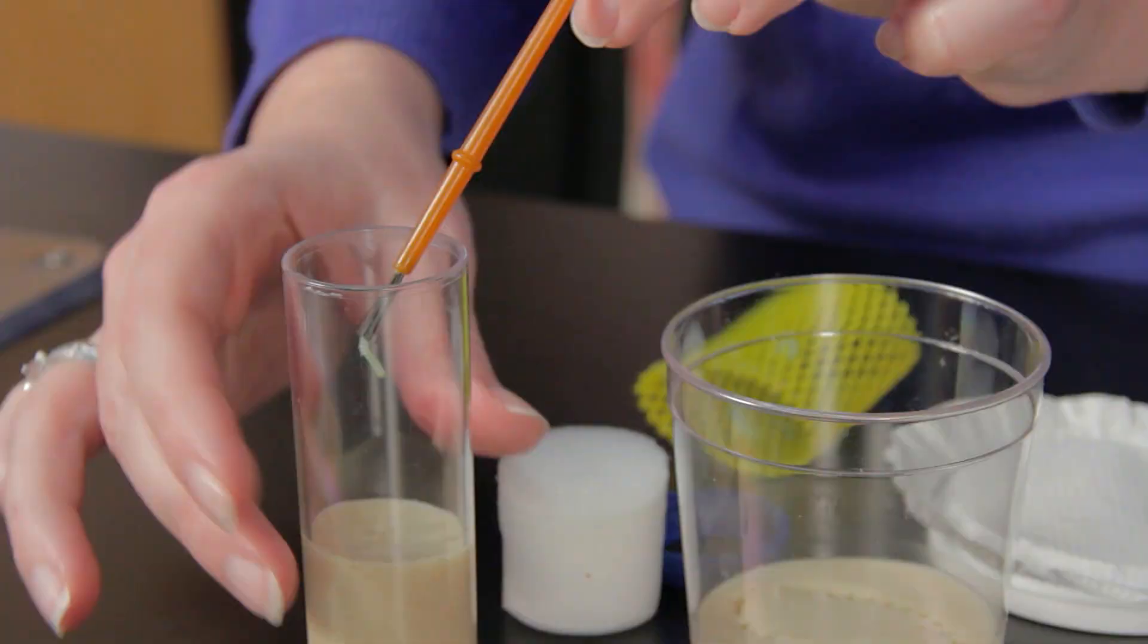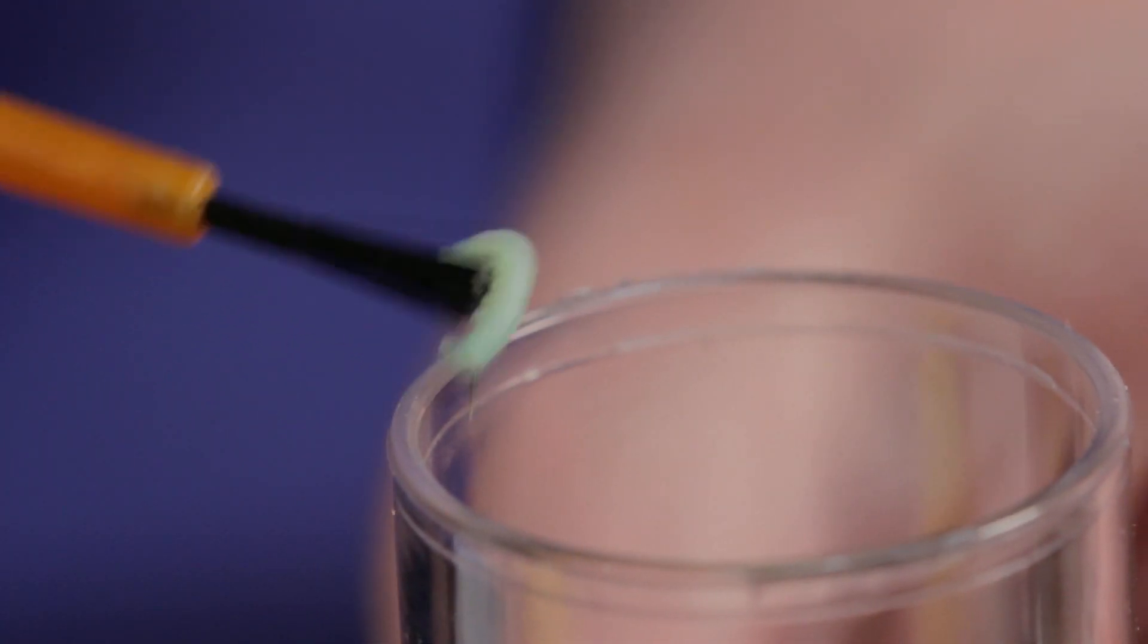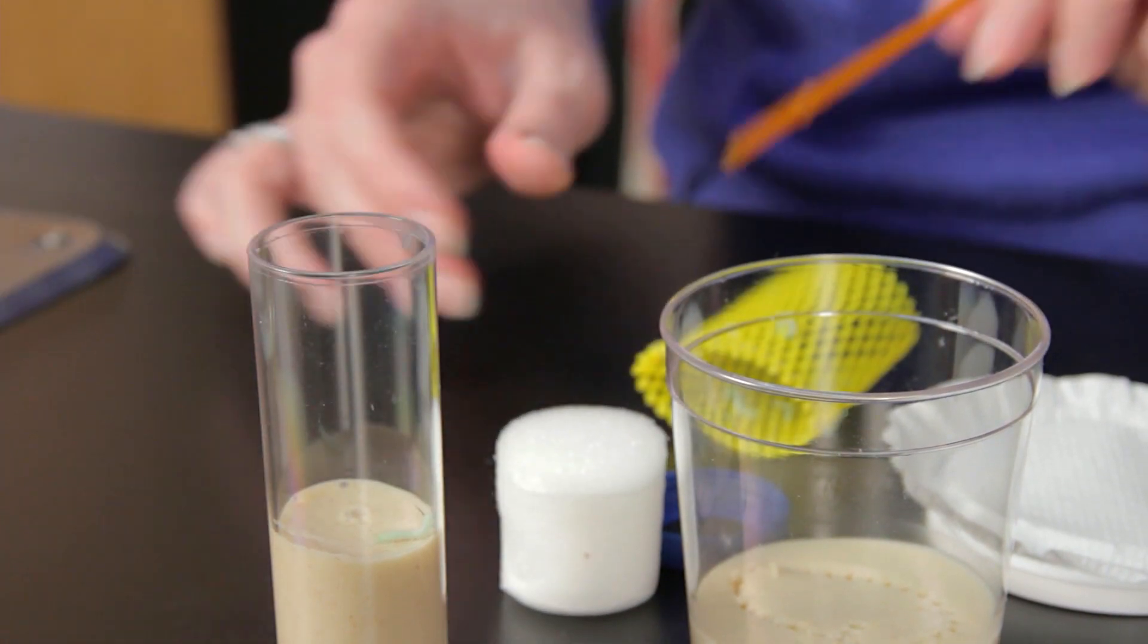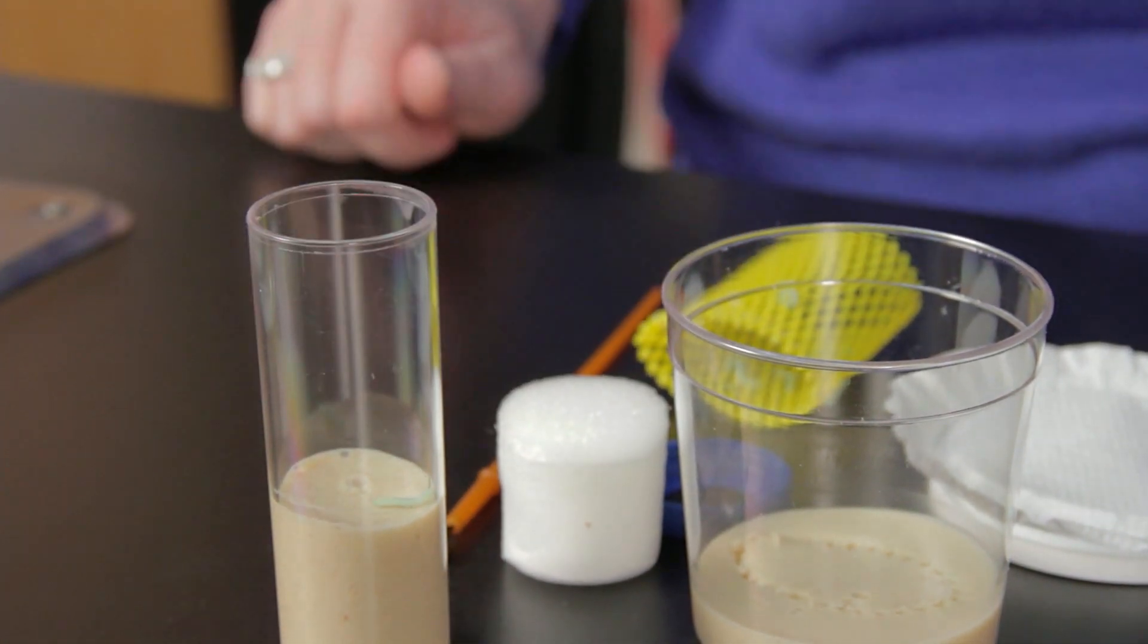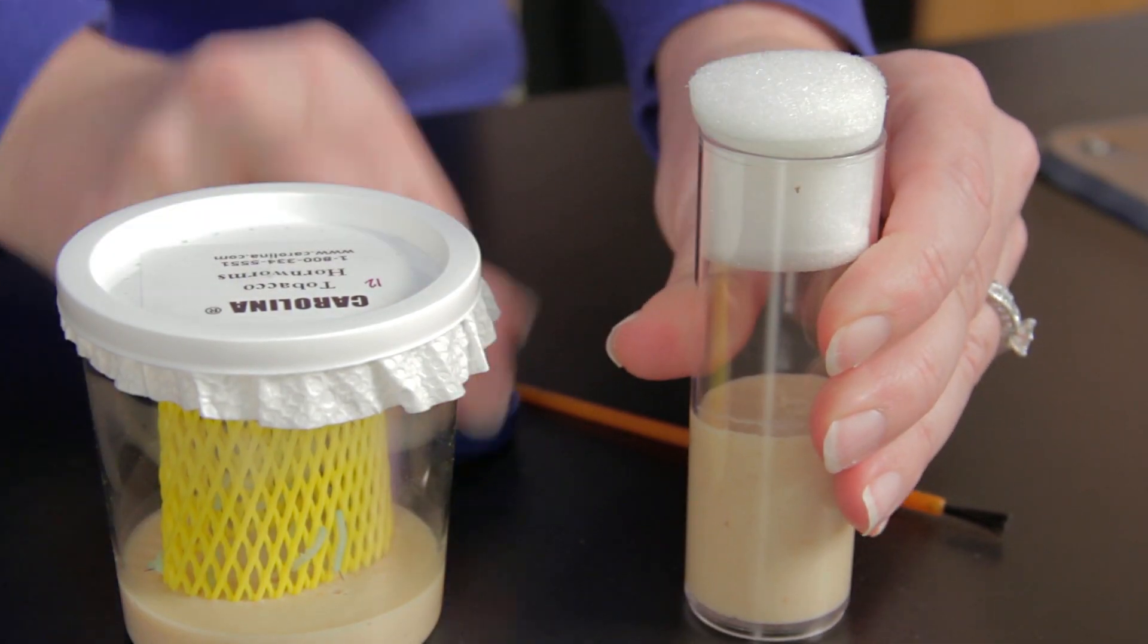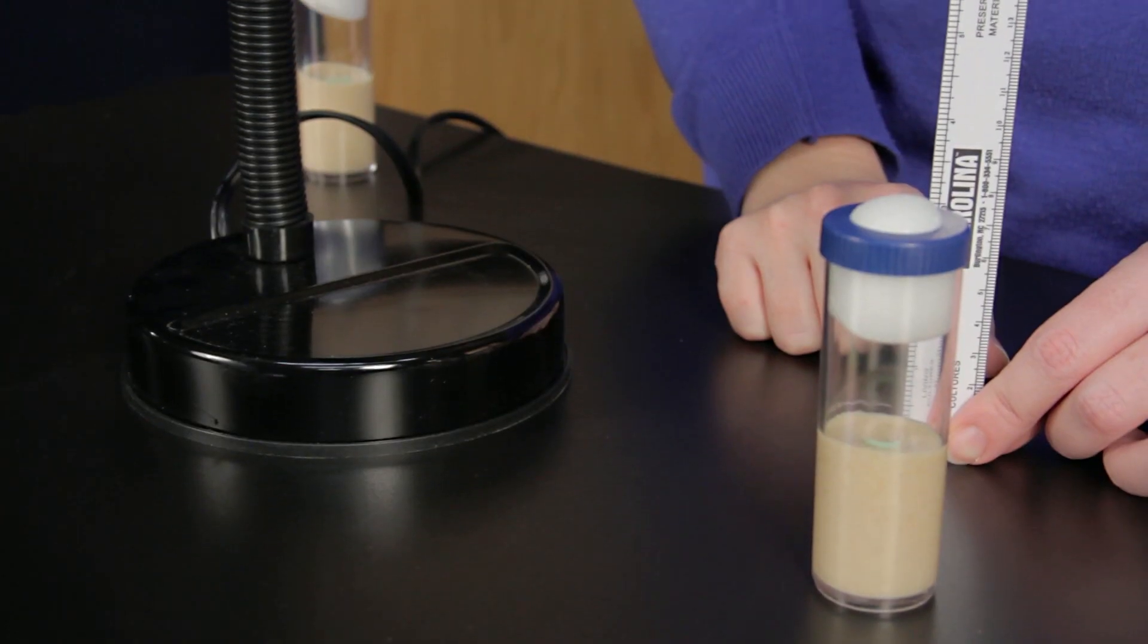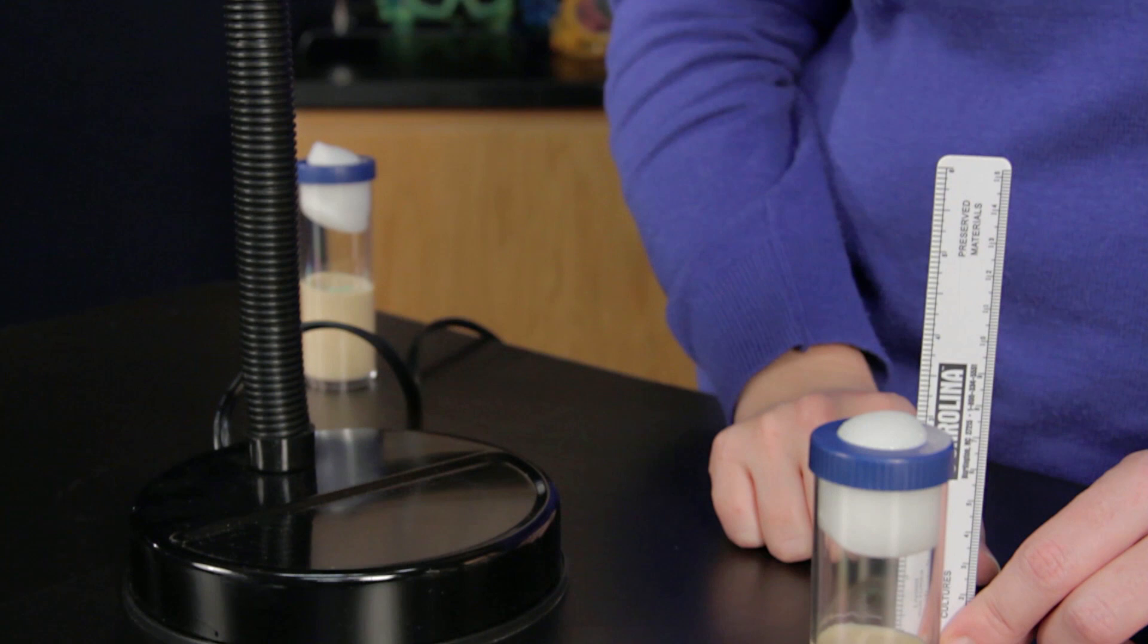Place a foam plug in the tube, then snap the lid on the vial and set the vial under a lamp with a 100-watt bulb. Starting around 25 centimeters above the vial, adjust the placement of the lamp until you gain a constant temperature of 27 degrees Celsius.